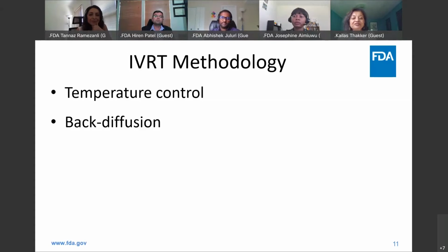Thank you. When you see a decrease in volume of your receiving chamber, you have a very significant amount of back diffusion. So that would not be acceptable, I'm sure. Then you have to go back to developing with a different type of receiving medium.